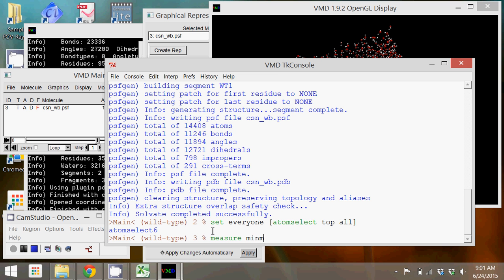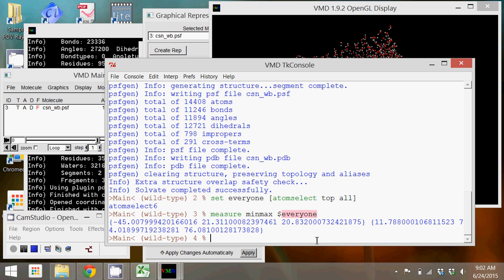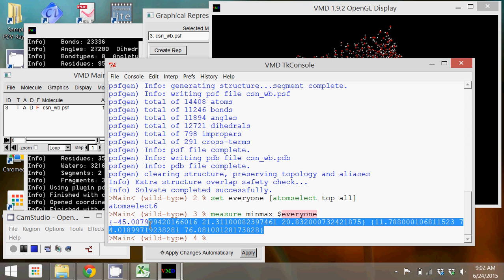And what I'm going to do is just copy those, so I highlight them, copy them. I'm just going to paste them into Excel here and keep those because we're going to use them in the next tutorial when it comes to actually simulating this enzyme.